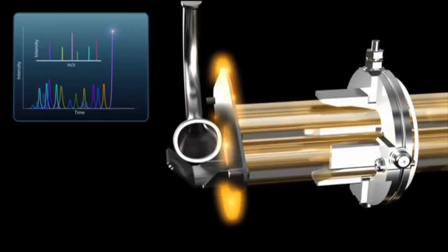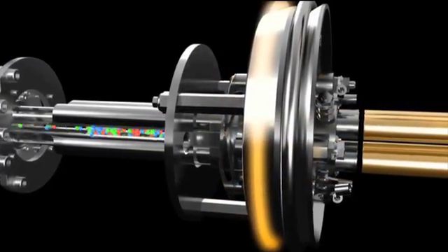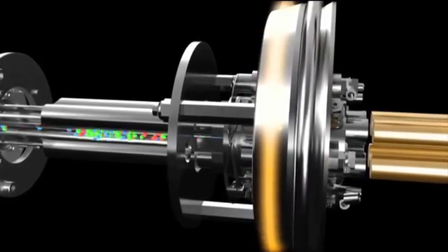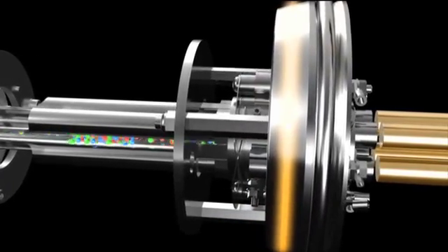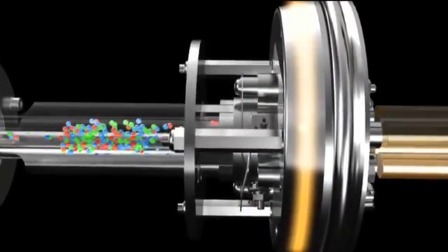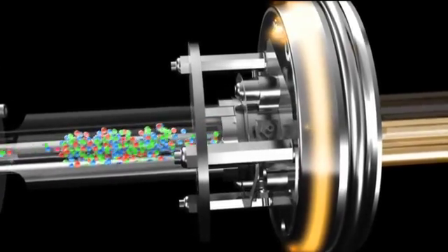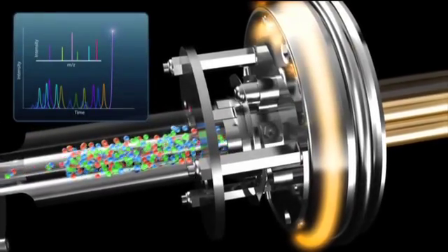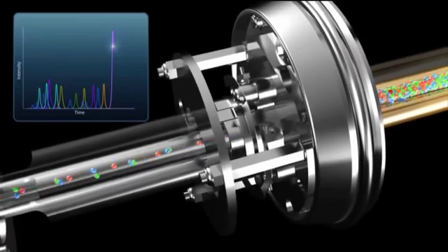During full-scan MS-MS acquisition, concurrent Q0 trapping is enabled to ensure you never miss anything eluting from your LC column. Once sufficient MS-MS data have been acquired, the system returns to MRM mode to detect the next transition.